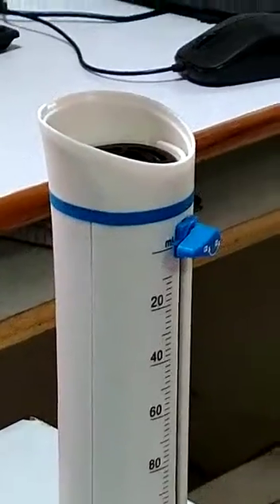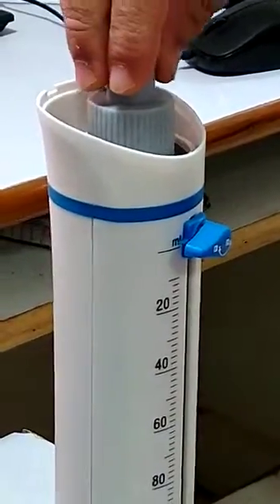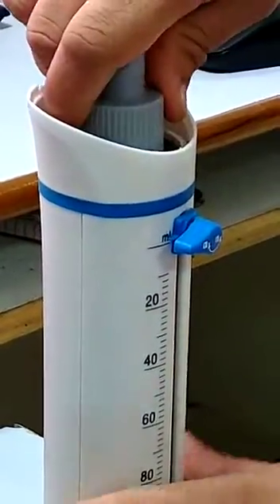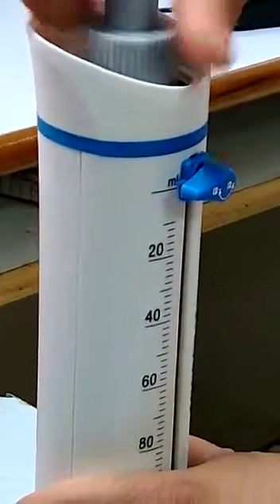All we have to do is place the calibration tool into the calibration nut and rotate in the clockwise direction. Now you can see the movement of the pointer when I rotate the calibration tool.